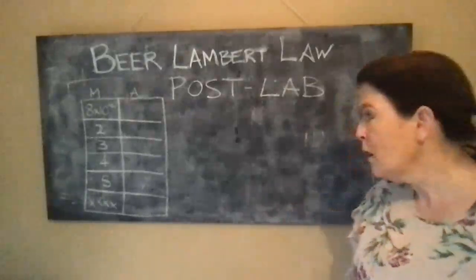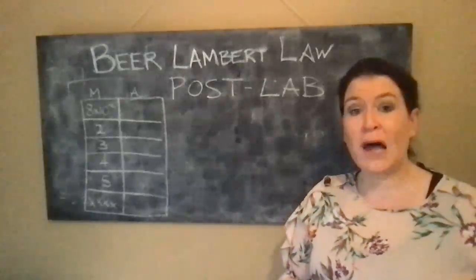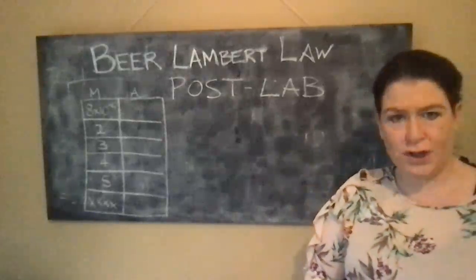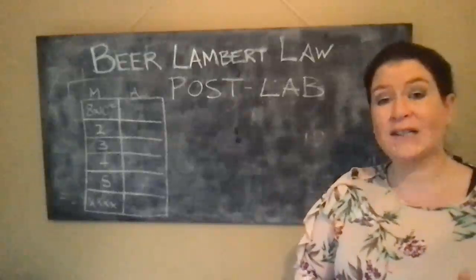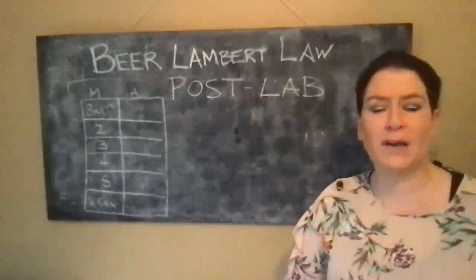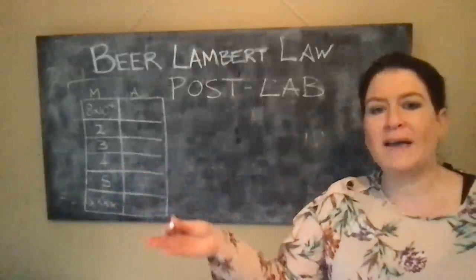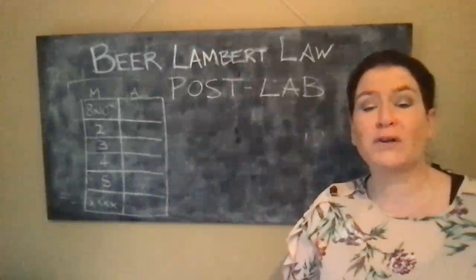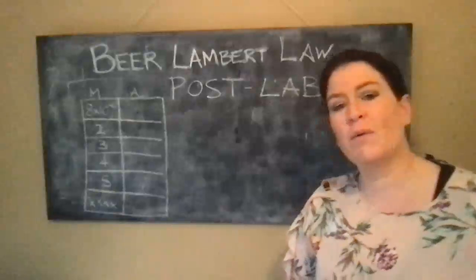Well, you're going to start with your classic approach to an analytical lab report: your title, aim, introduction, and set out the procedure as you did it, and remember to write it in the proper English way, in the past tense. This was done. A solution was made, not I made up a solution of, but a solution, a 0.02 molar solution of KMnO4 was made by weighing out blah, and so forth. So you will write that.